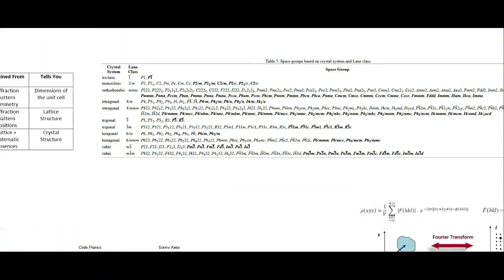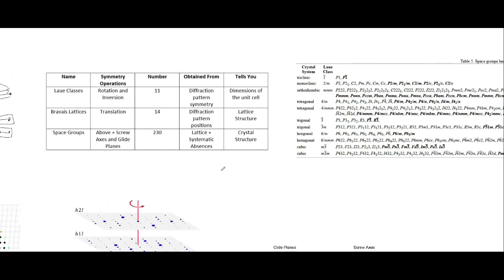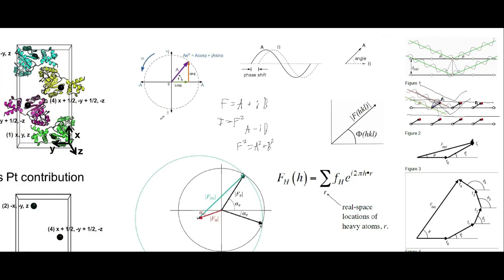We determined the space group of our crystal structure, which gives us the various symmetry operations.